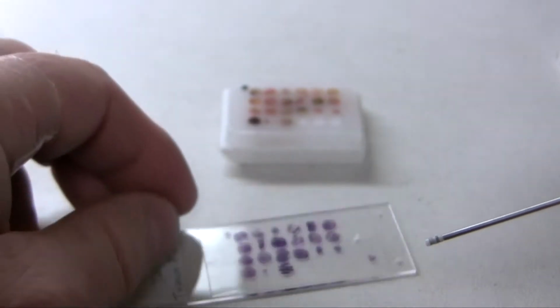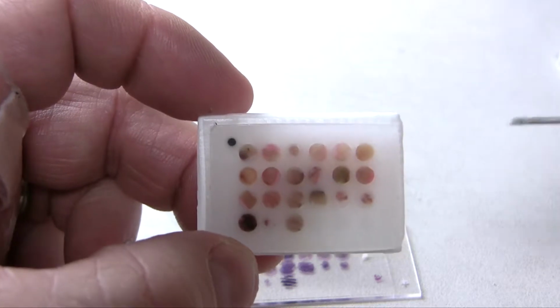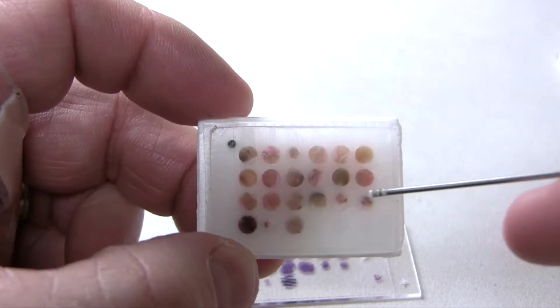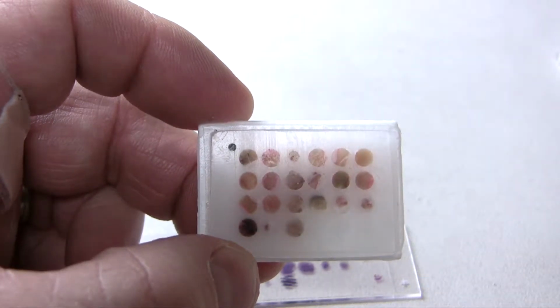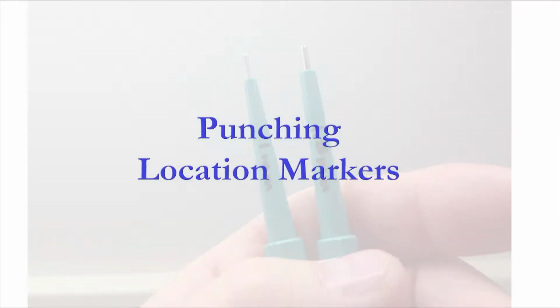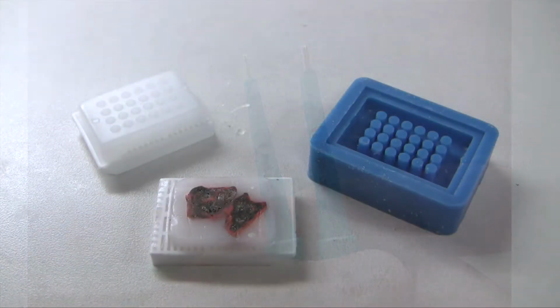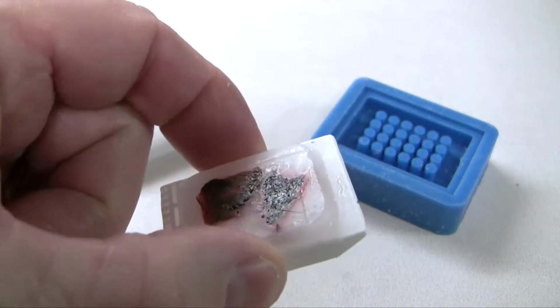This H&E slide represents the 100th slide cut from this Radical Tissue Microarray block. The 2mm cores are present, and the location marker is still visible. Always punch the location marker first before you add any tissue to your tissue microarray, just in case you crack the block. This is dyed lung tissue. Any tissue will work for this purpose.